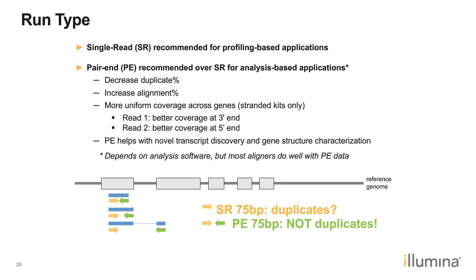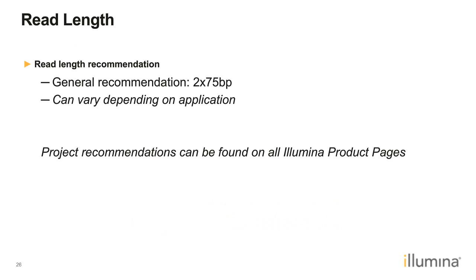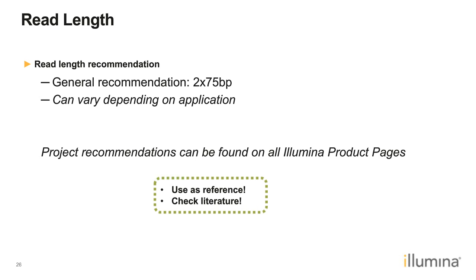In terms of read length, our general recommendation is 2 by 75. This is a very general recommendation, and it will vary based on the application. So you can use this as a reference, but always check the literature.